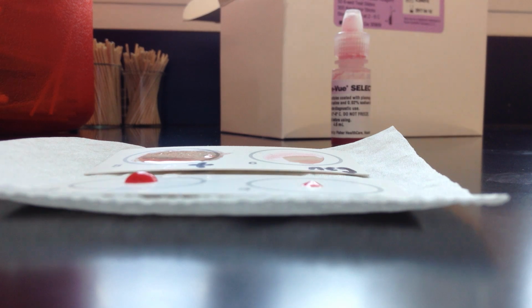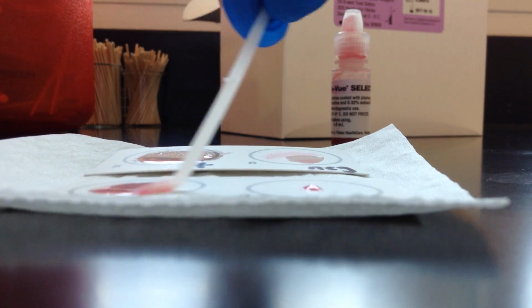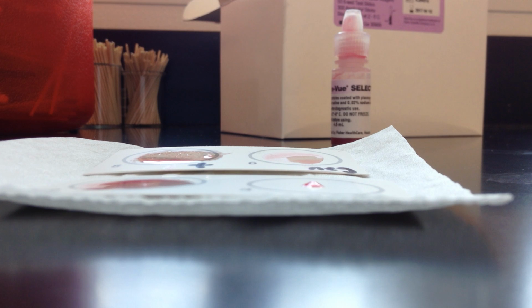And I'm going to place some bacteria onto the drop and mix it in, kind of put it next to it, mix it around. And it takes a few seconds for the reaction to occur. So while I do that, I'm also going to pick up some of the bacterium that I know is going to give me a negative result.